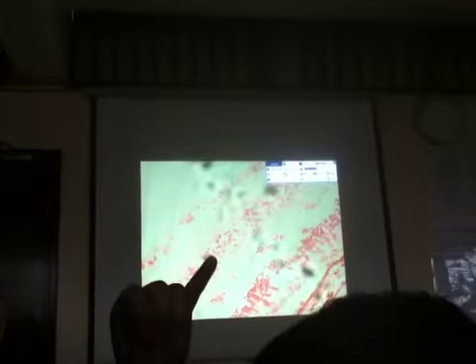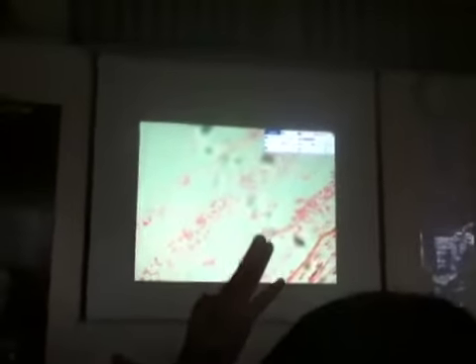Now, let us study the histology of the retina. What are the three types of cells that can be seen in the retina? Bipolar neurons, ganglion cells, and the photoreceptor cells, which are the rod cells and the cone cells. Now, what we will be able to see here will only be the nuclei of the three types of cells mentioned. Okay?